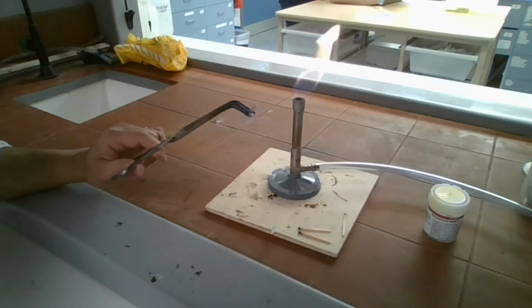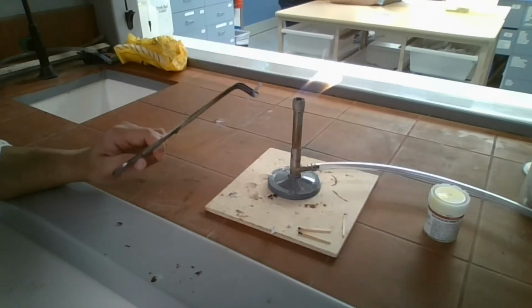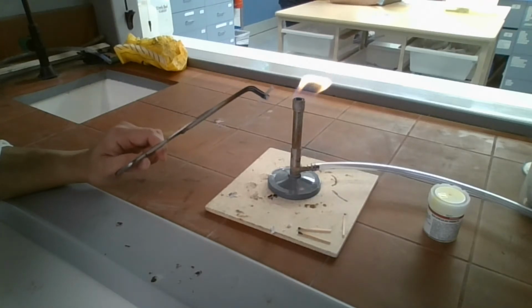During the reaction, a lot of light, which is energy, came out. So that's exothermic as well. A lot of heat also came out. So it's definitely an exothermic reaction.